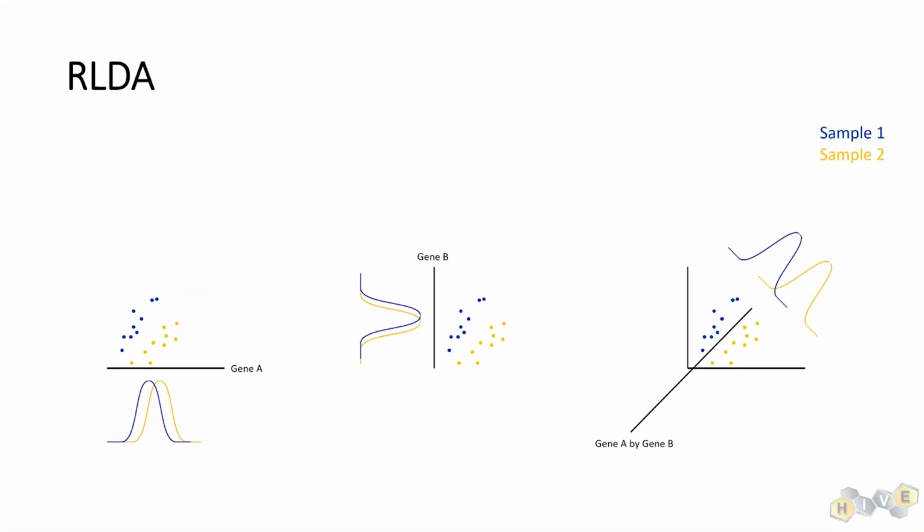So anyway, that's the way this works. It could never do this by brute force calculation, of course. If there's 190,000 transcripts in the human genome and any given cell is expressing as many as maybe 12,000 of those, then even trying to figure out if there's a 2-gene effect is enormous because you would have to step through every single possible combination, let alone if there was more than 2.